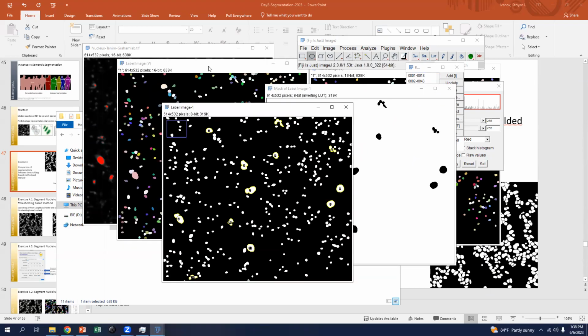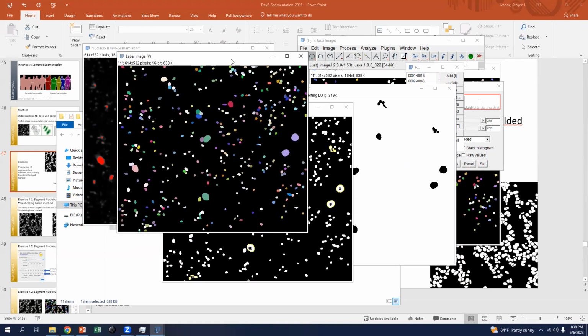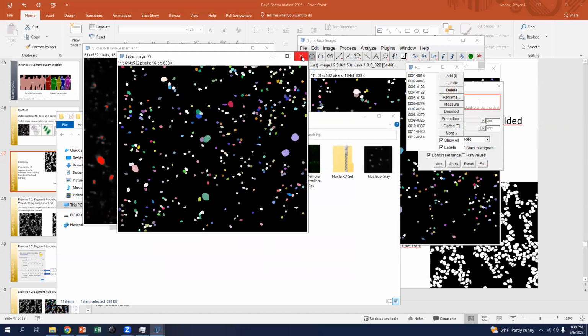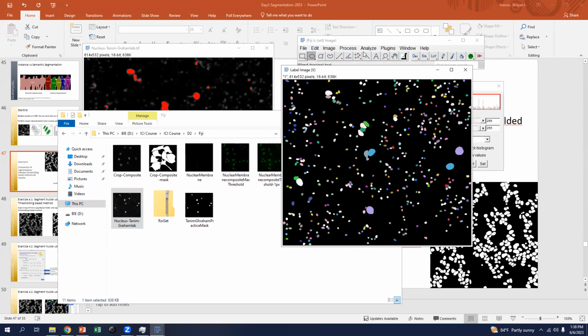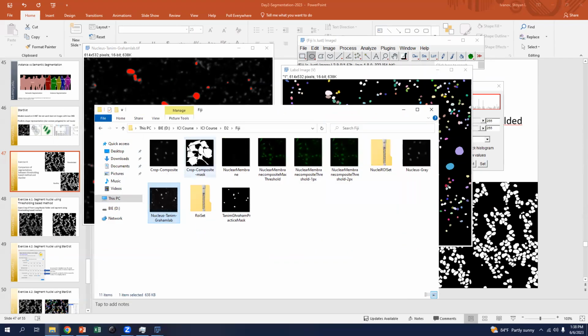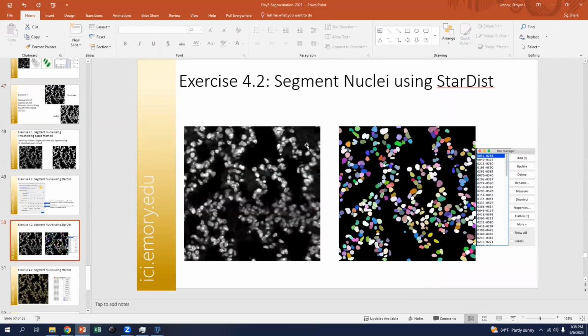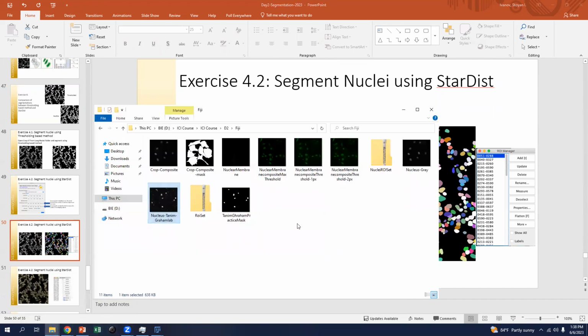Once we threshold the image, we can threshold it relatively easily because there is no signal in the dark areas. So that way we can filter out the smaller punctated noise. But I would recommend that everyone give it a try sometime. It's free. You can download it from the Fiji update sites. At least as a first run for segmenting some wild images like this, it's definitely a good choice. I don't seem to have that image.